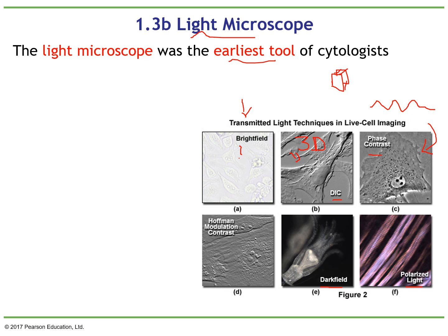So the things that are different brightness inside of the cell and outside of the cell, in that way we have more contrast. Well, here in the bright field everything looks the same. Here there's little contrast between the cell and the background. Here in the dark field we have much more contrast between the cell and the background.